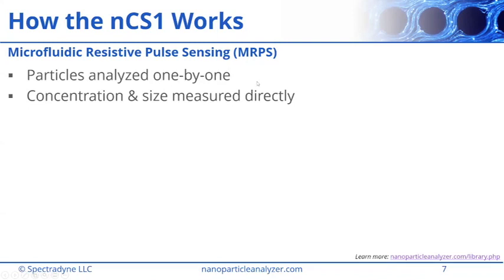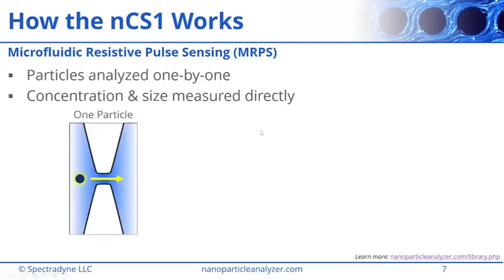So in contrast to optical techniques, where the size is inferred from its Brownian motion, for example, or where the concentration is inferred by geometric assumptions, we're not doing that here. So let me explain how that works.